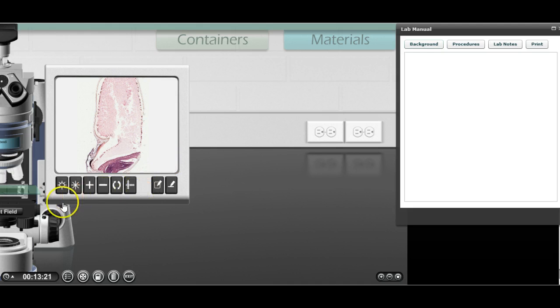Now then, let's go in a little bit closer, or you'll need to go in a little closer. This is going to be the cotyledon right here. This structure, the pointy end, is the epicotyl. The blunt end is the radicle. So take photos of that, mark it, and then save it, and I'll take a look at it and see how well you did. Thank you. Hope you do well with this lab.